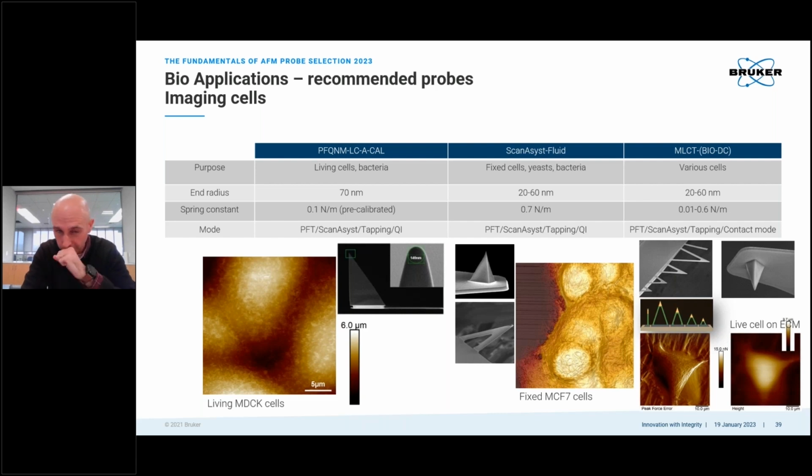So most people, and I experienced this doing my PhD, would just let it settle, and it'll bend a little bit, and you wait for the photodetector spot to stop moving, and then you do your experiment. But we can now actually design to get around that problem completely by just having this metal coating right at the end, where you put the laser spot, so you still get the reflectivity and signal increase, but it's not enough metal to flex the probe, so you don't drift so much.